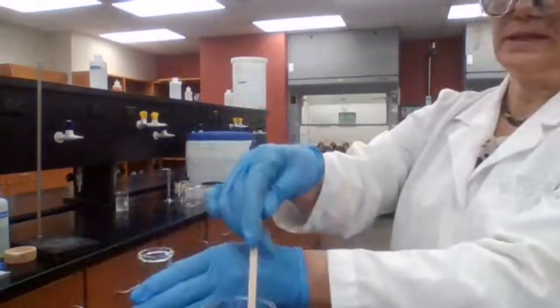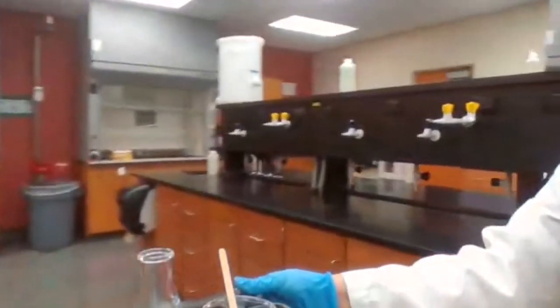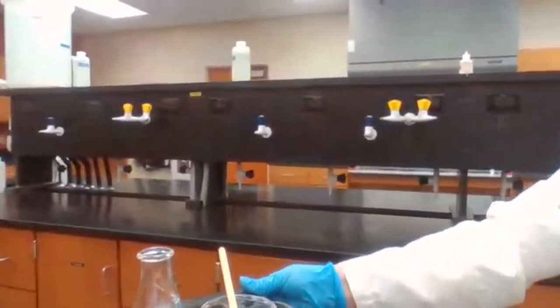We place a wood stick. What the wood stick does is help the boiling. It's going to make the boiling faster.